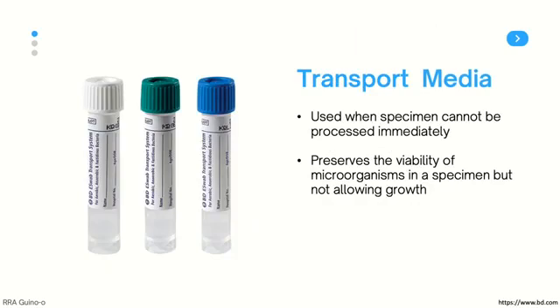Finally, we have transport media, and this media is used when specimens cannot be processed immediately. This media can preserve the viability of microorganisms in a specimen, while at the same time not allowing them to grow. Most transport media only contain a salt and buffer. It does not contain any usable carbon sources for the bacteria, which is necessary for their growth. You should also note that some transport media may contain glycerol if the media is meant to be frozen.